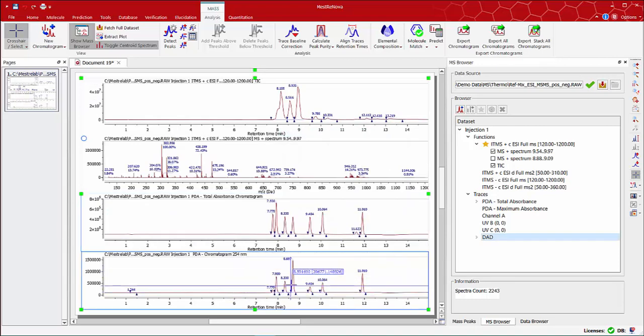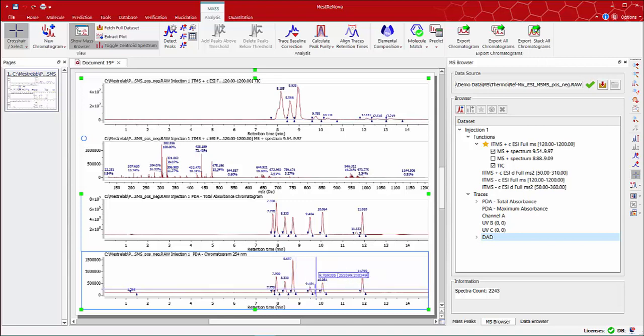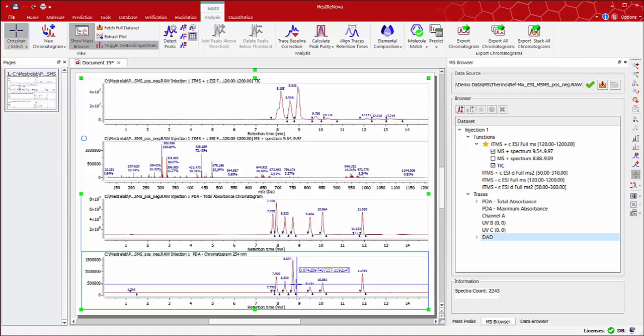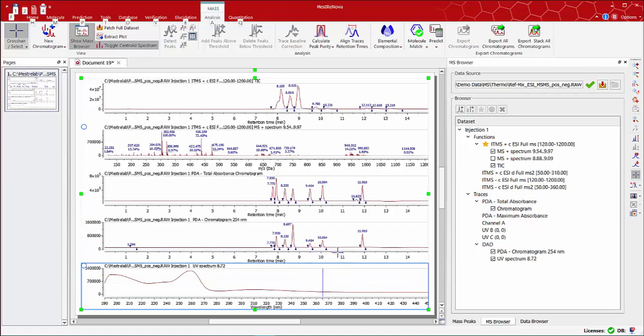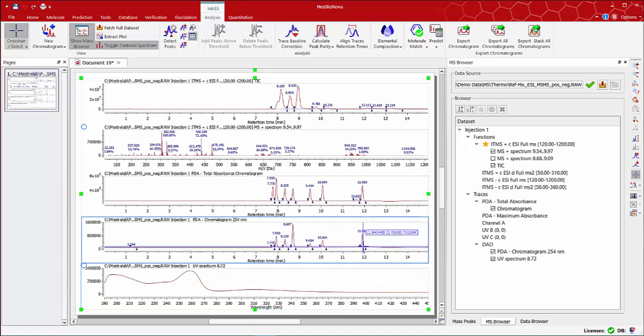If you want to display the UV spectrum at certain points, you can press and hold the ALT key and click on any specific retention times to show these traces.